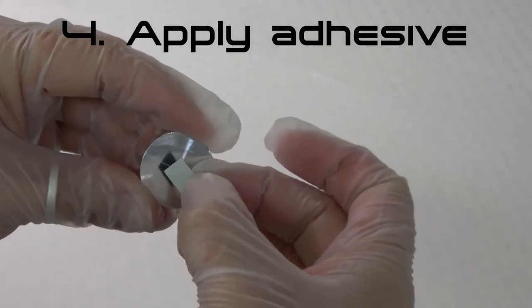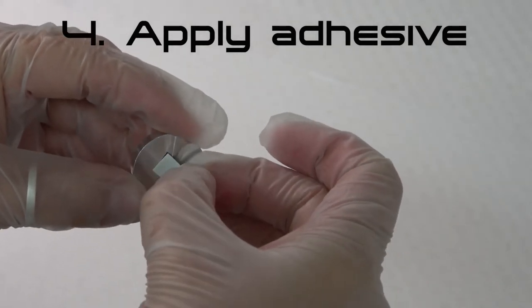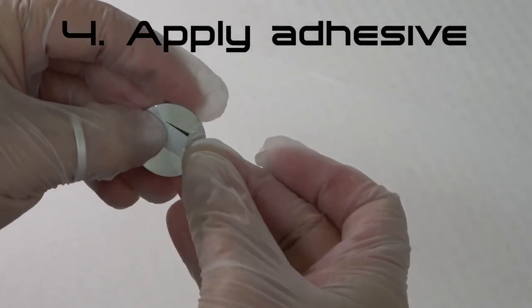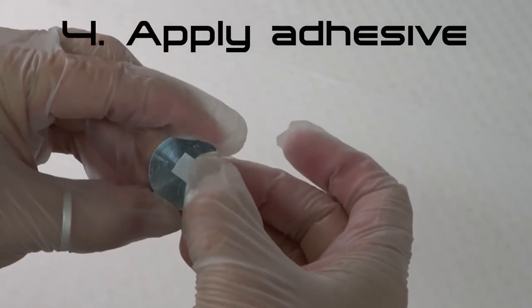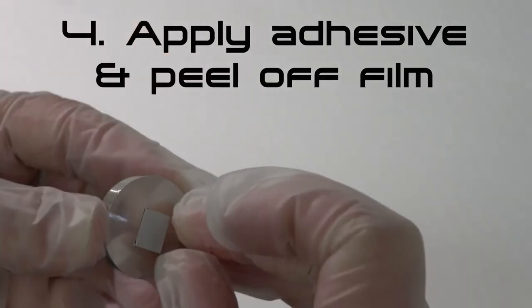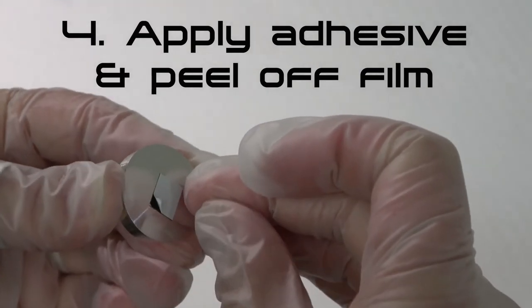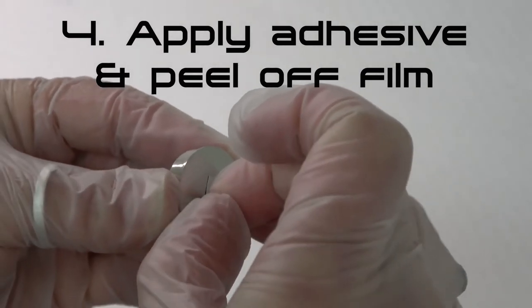Step 4: Place one side of the double-sided adhesive onto the SEM stub. Use only enough adhesive to ensure that the sample can be securely attached to the stub. Remove the protective film to expose the surface of the double-sided adhesive.